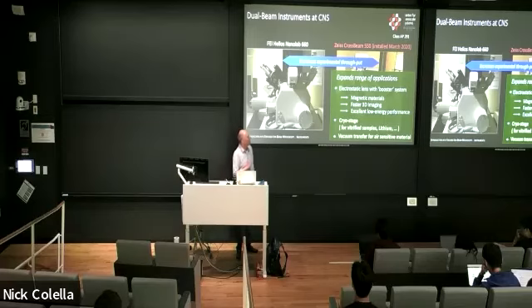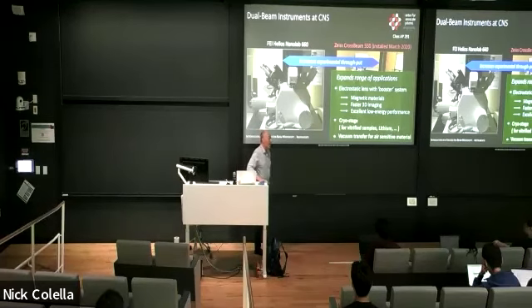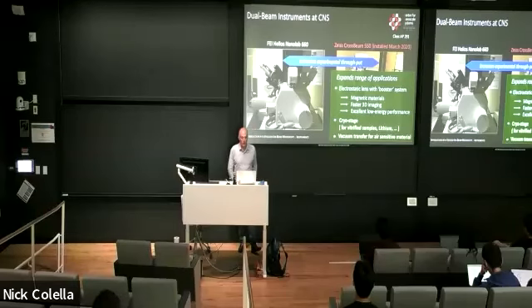But the major difference in terms of applications is that we do have a cryo stage for that tool. And at the moment, this is the only focus ion beam where we can do air-free transfer of material.